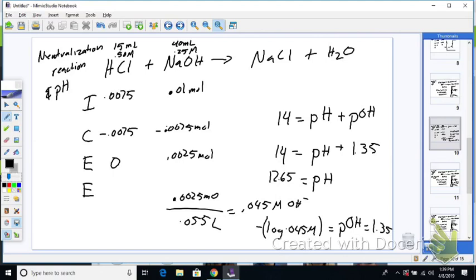Your second calibration point is the other solution. So if you had 4, you put it in 10. Just shake it off so it doesn't get in the other one. Put it in the other pH, wait for the voltage to settle, and then press keep. Once you do those two, you can press OK, and it should be calibrated and ready to go.